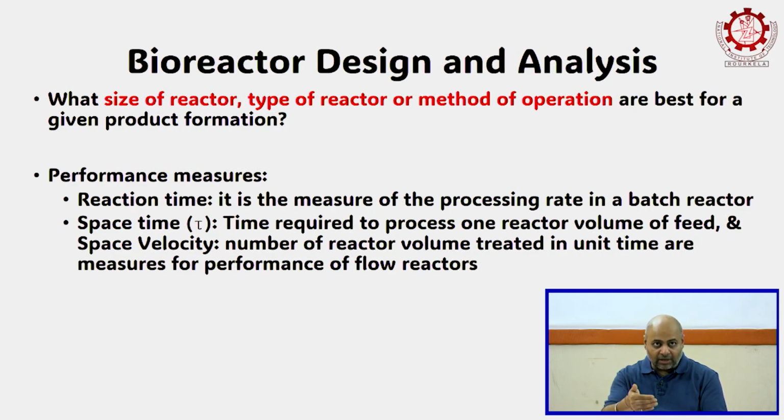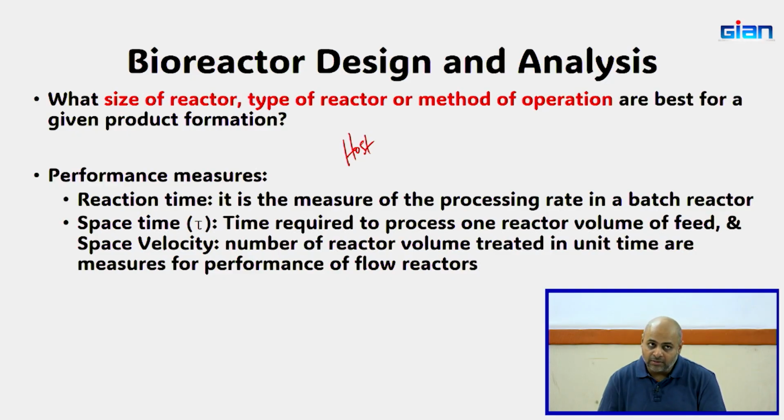You have to choose the right bioreactor. But that choice will depend on the host that you have chosen, correct? It will also depend on whether your product which is made is extracellular or intracellular.